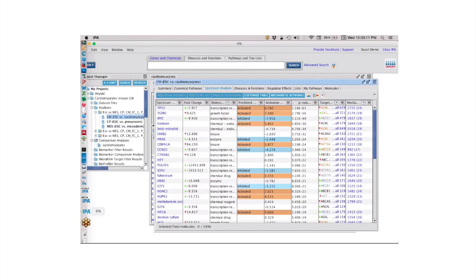How did you create the comparative heat map between different cells? I can show you that really quickly. I know we're out of time, but if you're patient, I don't mind staying a few more minutes. You run your analyses in IPA, and if you happen to have them all in the same data set, let's say in this example we've concatenated those 3 data sets into one Excel file, like 3 conditions in one file, then they come out as a folder of analyses in IPA.